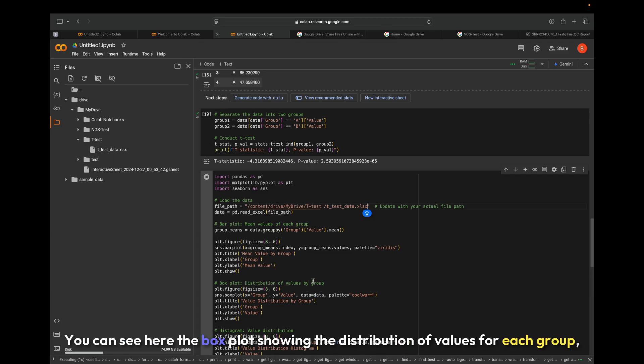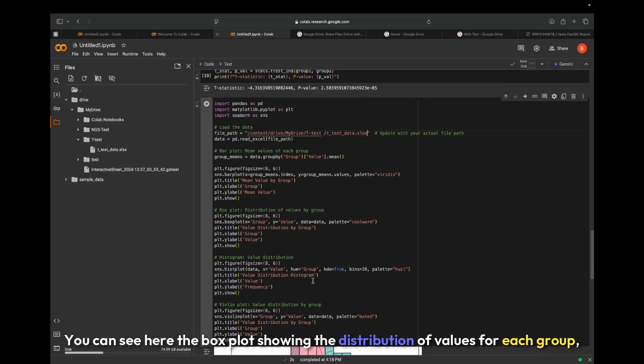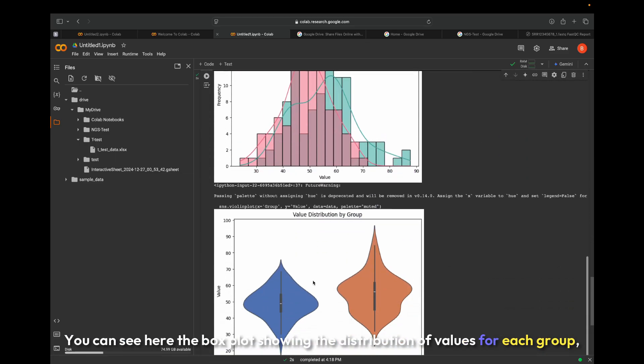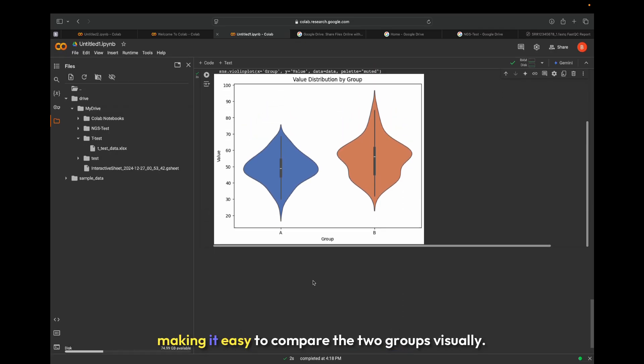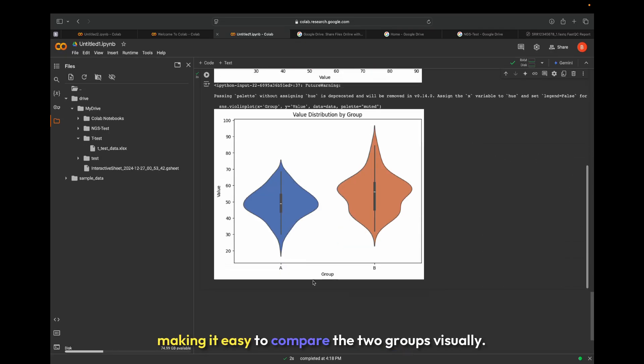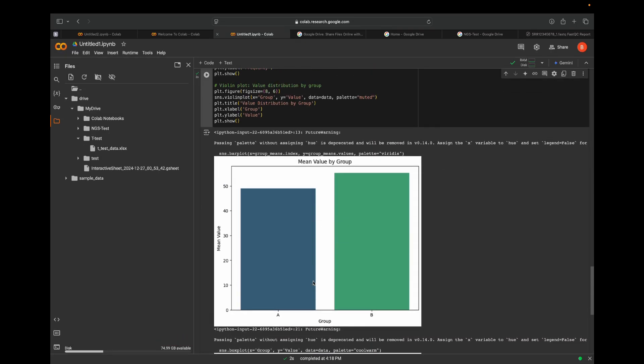You can see here the box plot showing the distribution of values for each group, making it easy to compare the two groups visually.